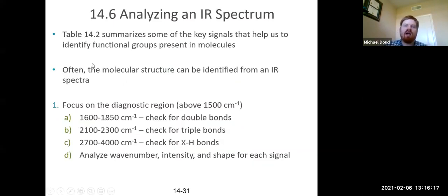Then I just wanted to summarize some important data from IR, hydrogen NMR, and then we'll look very briefly at carbon NMR before we call it quits for this little lecture addition down here.